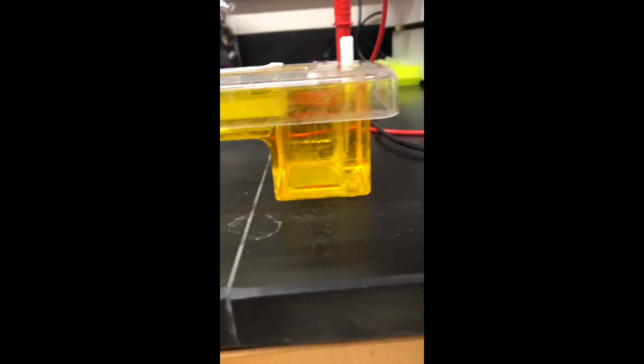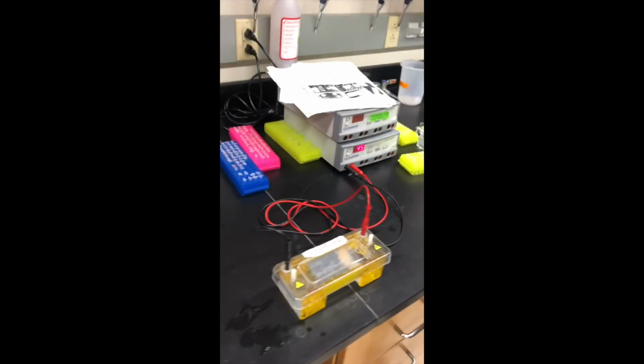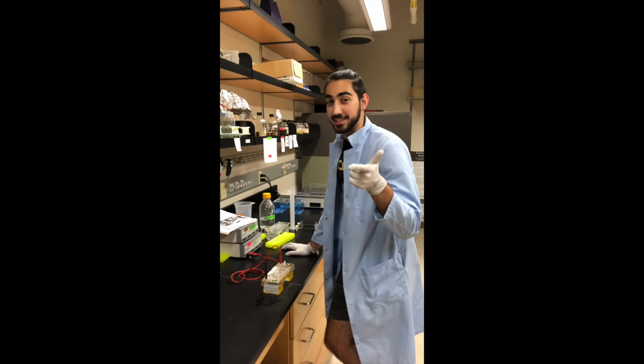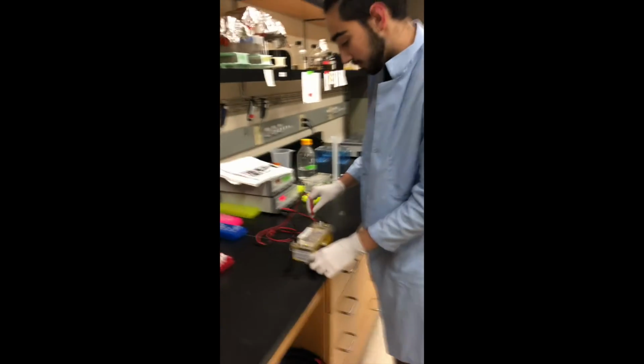And you can see a bubbling effect start to happen, and that's kind of how you know your gel is working. So it takes a second, and then hopefully you can see it there on that camera. But now we'll see you guys in about 45 minutes. Later that same evening. Hey guys, it's been 45 minutes. We're done with our gel. Let's take a look at how this bad boy turned out.